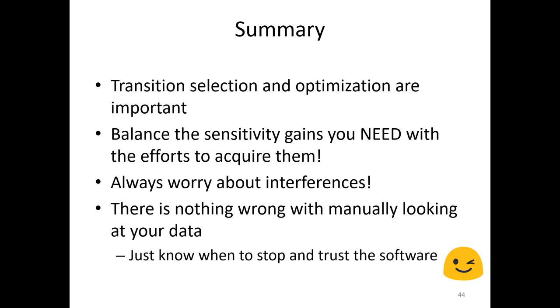And there's nothing wrong with manually looking at your data. However, you can go down a rabbit hole, so make sure you know when to stop and trust the software. And in that respect, Brendan had made leaps and bounds progress when we first started, because I was looking at tables of numbers to see if there were interferences, and I was going cross-eyed by the end of the night. And simple requests of, hey, I think it would be easier if this could be a visual approach, or something could look like this. And if you get enough people to agree with you and then ask for it as a feature, it could happen in Skyline. That's one of the nice things about it.